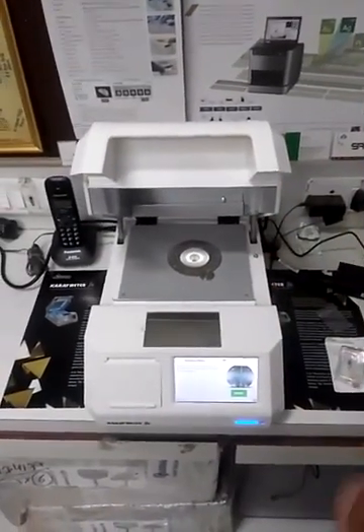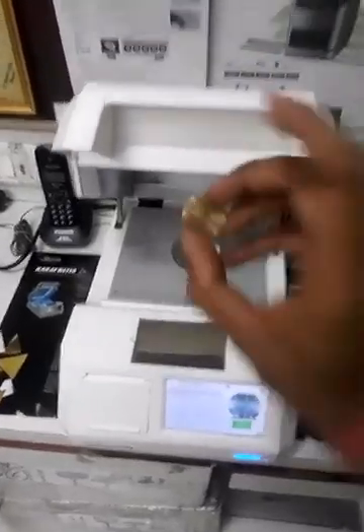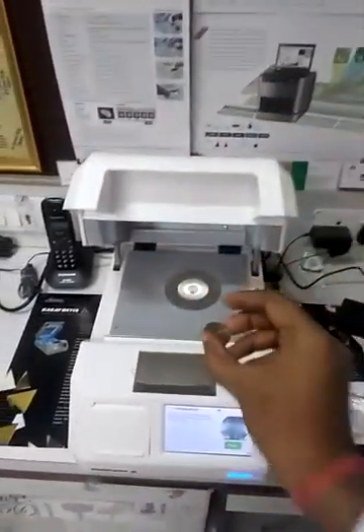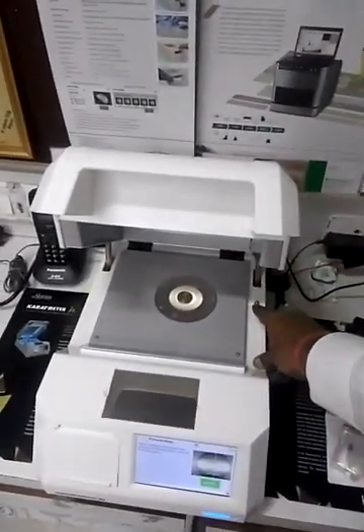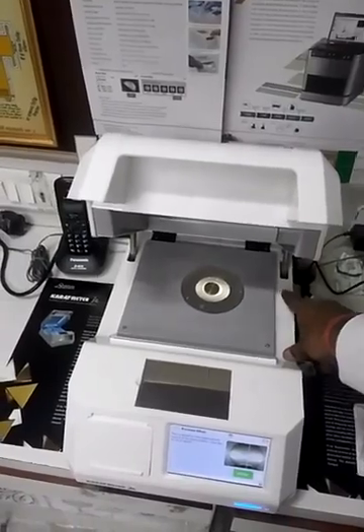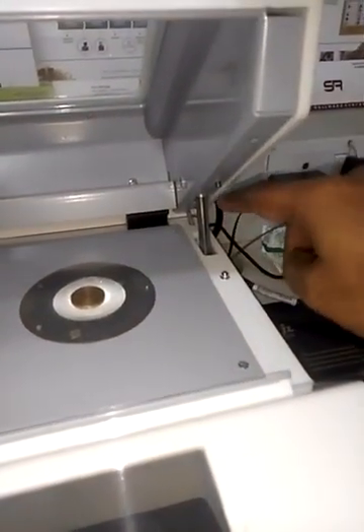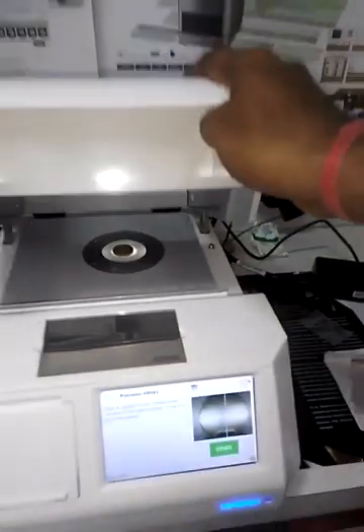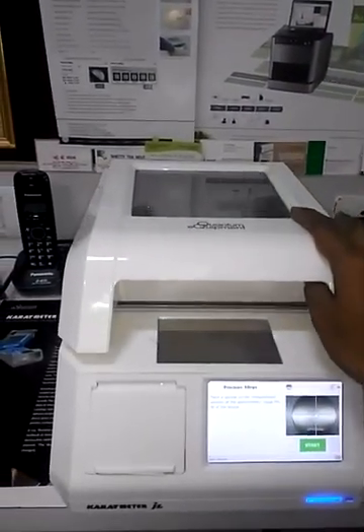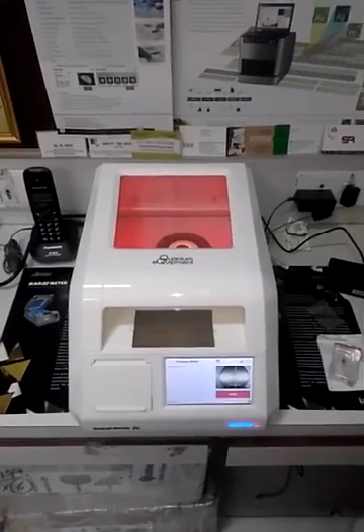Now the machine is on. You can put one reference standard, which is given to you for this kind of unit. This is the main button, and the reference is placed through this knob. That's how we say the machine is on. Let's start the job — this is the reference.